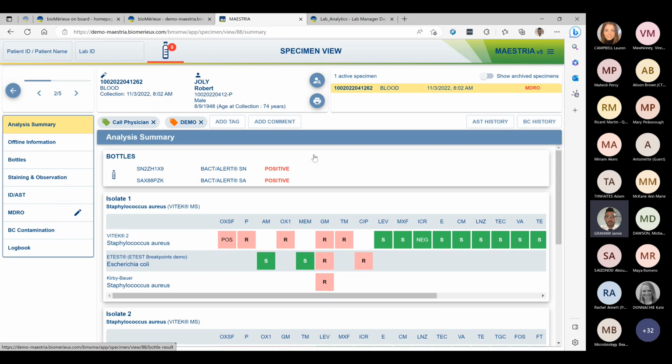So speaking to some customers when I was demonstrating this a couple of weeks back in Dublin at Biomedica, they said that one potential use for this might be for handover from one shift to another, where there are various outstanding tasks that always need to be looked at first. Instead of having post-it notes or notes around the laboratory, you could create a tag, because these are fully configurable for handover. And then you might have 10 or 15 tasks that need to be looked at first. As soon as it's done, you take the tag off and then it drops out of the list.